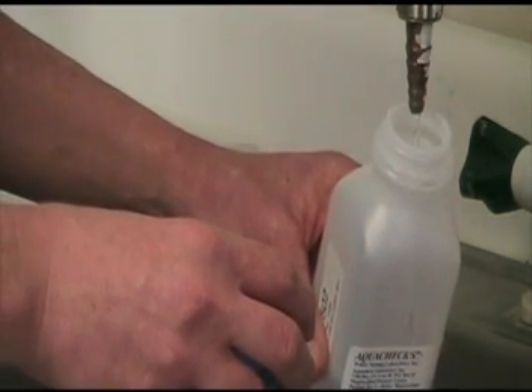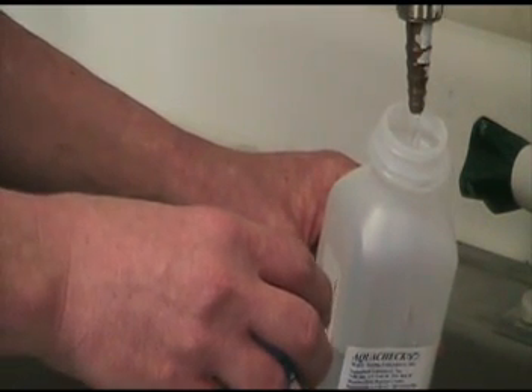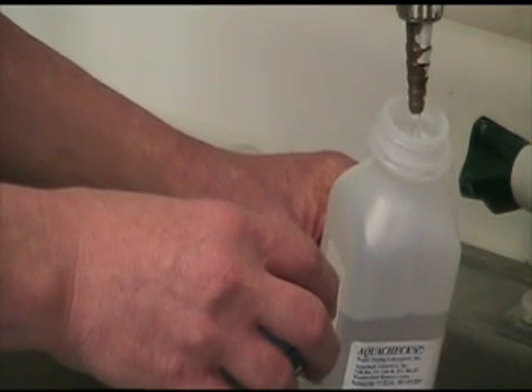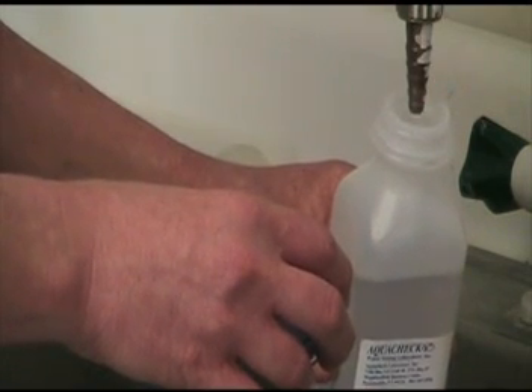Run cold water tap for 3 to 5 minutes. Then rinse sample bottle once and fill to the shoulder. Replace the cap securely. Transport to your laboratory at 0 to 6 degrees centigrade.